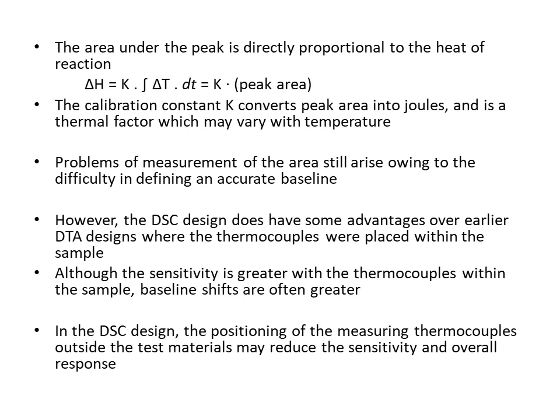However, the DSC design does have some advantages over earlier DTA designs. In DTA designs, we know that the thermocouples were placed within the sample. Although the sensitivity is greater with the thermocouples within the sample, so when we put thermocouples inside the sample, sensitivity is increased.